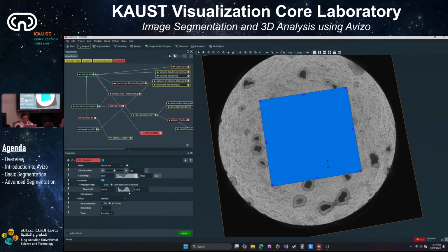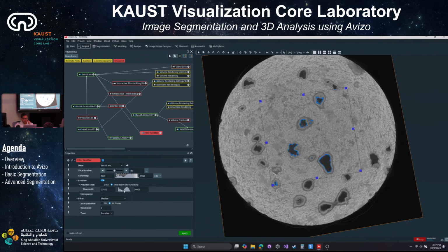Yeah, if you change the threshold thing, it actually gives you a preview of what the thresholding result would be if you've applied the filter first, right? So this is really good for just trying different filters and see how it improves or like worsens your result, right? So I can try different things. And of course, you'll have to play around with the threshold value here.